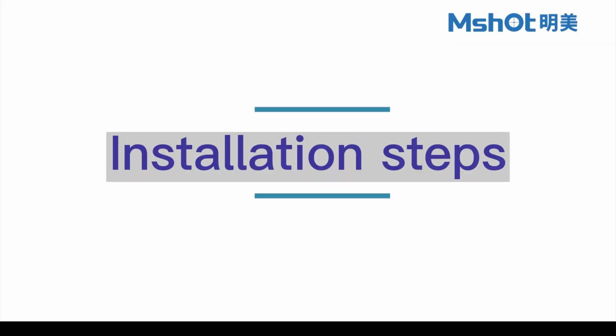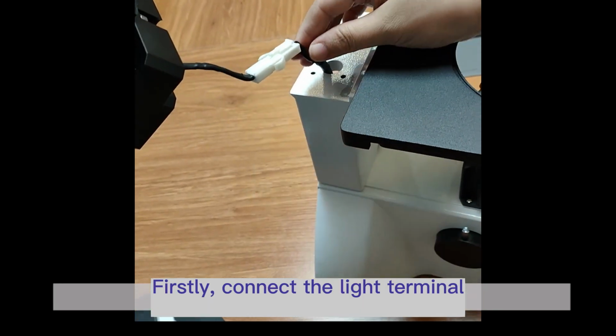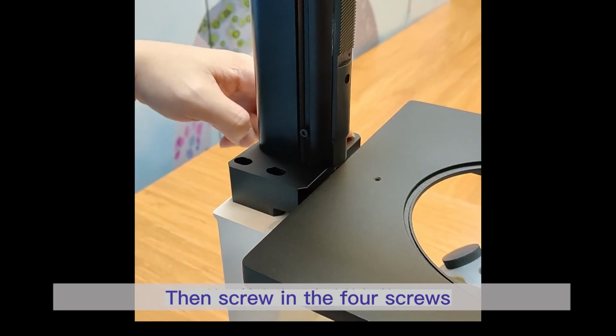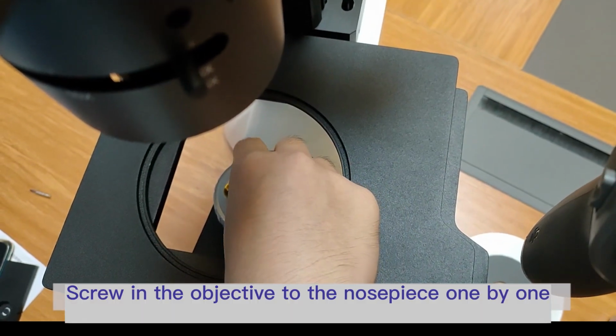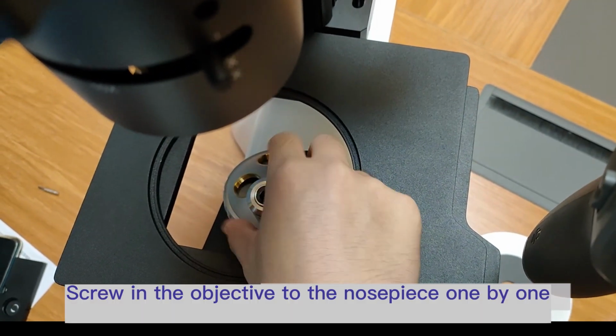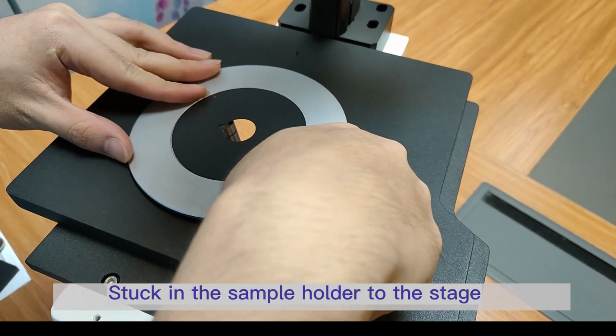Installation steps. Install bright field light and arm. Firstly, connect the light terminal, then screw in the 4 screws. Install objectives. Screw in the objectives to the nosepiece one by one. Put on sample holder. Stick the sample holder to the stage.